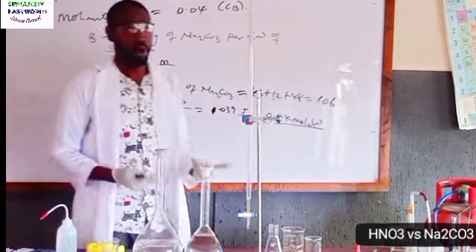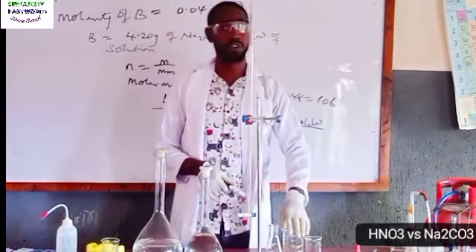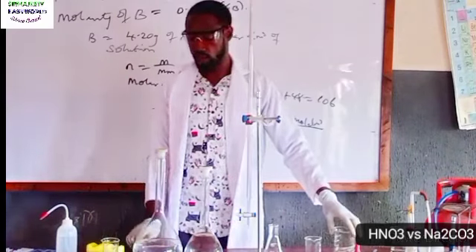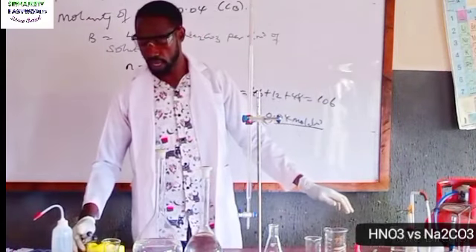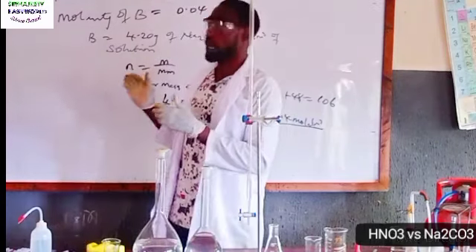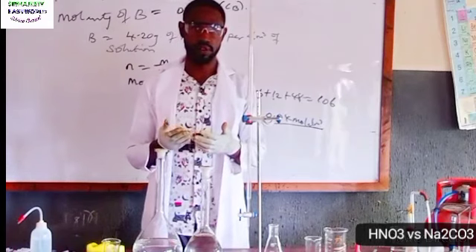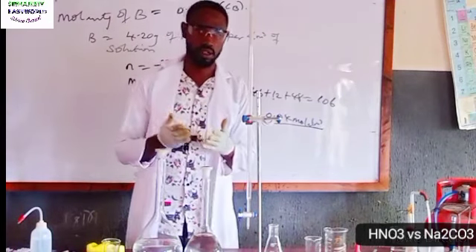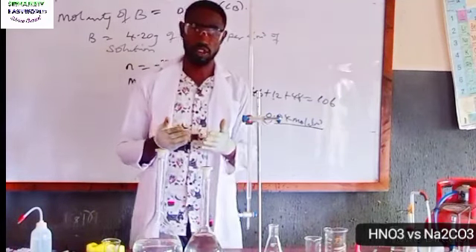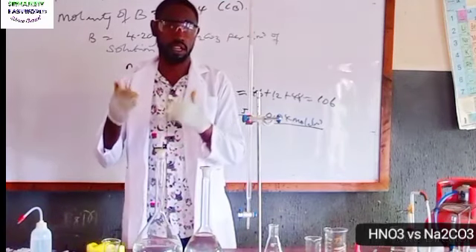Having known all this, one can actually manipulate the endpoints, but what matters here for your endpoints, remember to interact with your students. There is no particular endpoint that is the best, especially in this case where the examiner did not give you the percentage concentration of the HNO3. They didn't tell you 65% or 70 or 75%, they just say 9.50 cm cube of the HNO3.